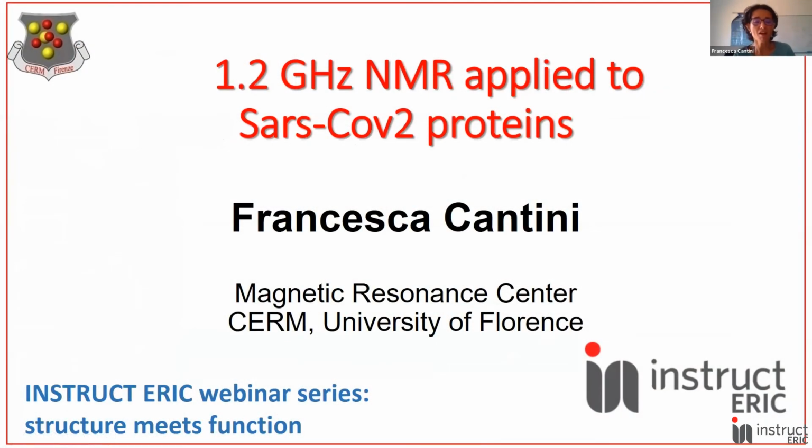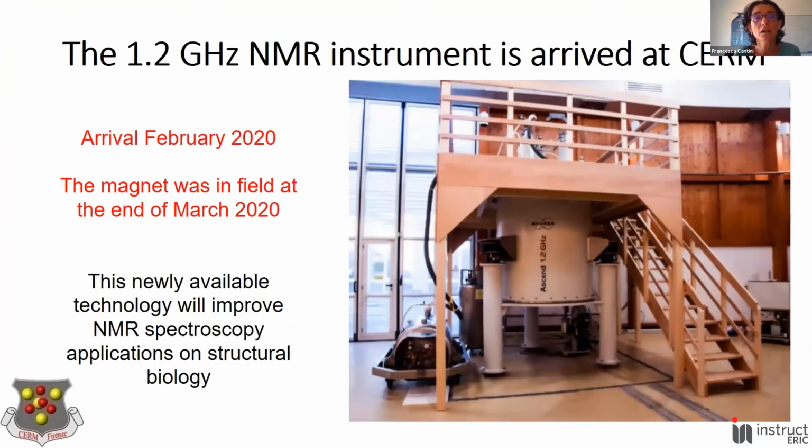So good morning, and thanks for inviting me to the second Instruct-ERIC webinar series. I would like to show some new results obtained on SARS-CoV-2 proteins with 1.2 GHz. As Lucia already mentioned, the CERM is now equipped with the new 1.2 GHz instrument, and the arrival of the magnet practically coincided with the arrival of the SARS-CoV-2 virus here in Italy in February 2020.